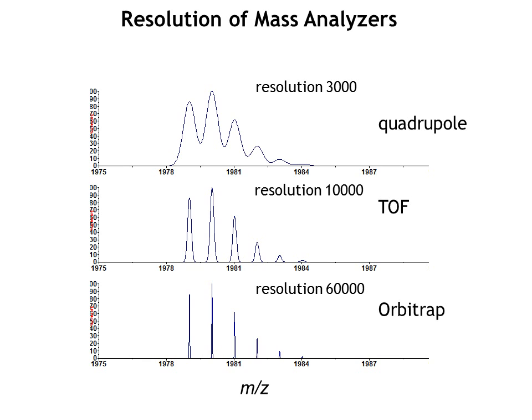With resolution of 10,000 in a time-of-flight mass analyzer, the isotopic peaks can be fully resolved and thus the mass measured with more accuracy. If we use an Orbitrap mass analyzer, the resolution at 60,000 gives very sharp peaks and plenty of space in between. So the peaks can be easily resolved, and even molecules of higher mass-to-charge ratios can be resolved, or of higher charge states.